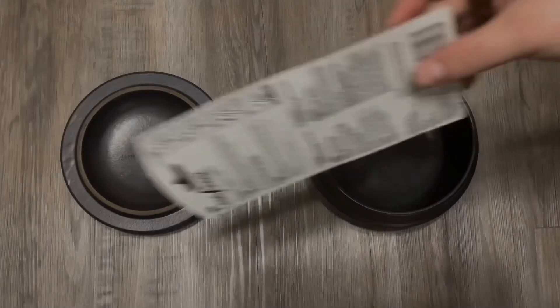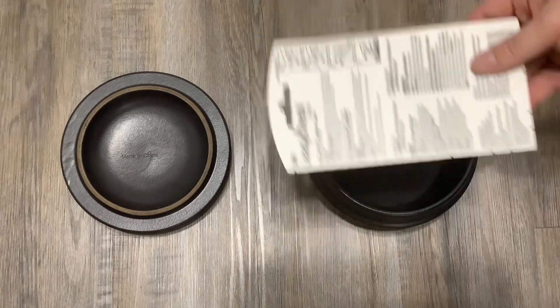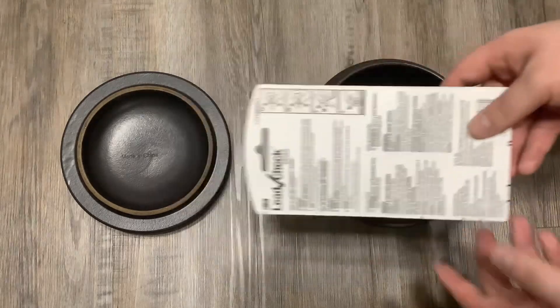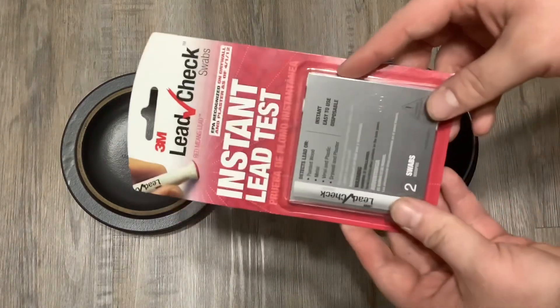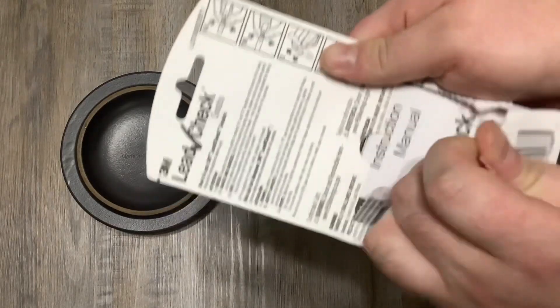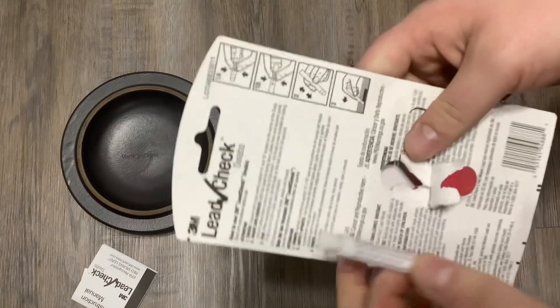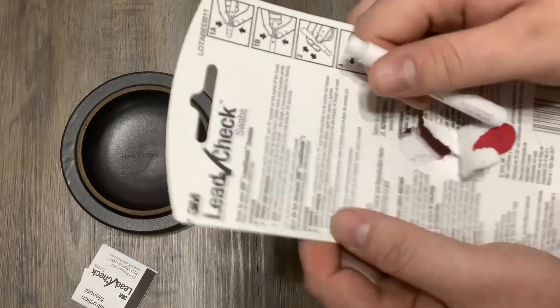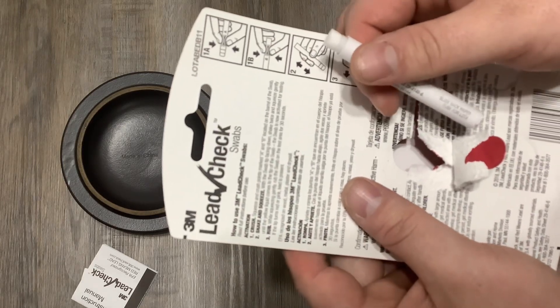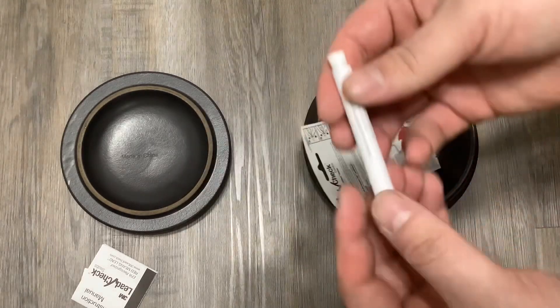I'm not going to say where I got this because it's from a local Asian market, even though these are probably sourced from all over the world. There are two tests in the kit. The instructions say to squeeze and crush points A and B, then shake it and squeeze the fluid out — so we're going to find A and B.